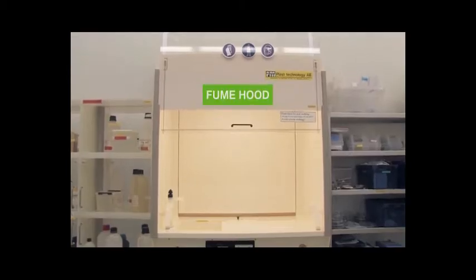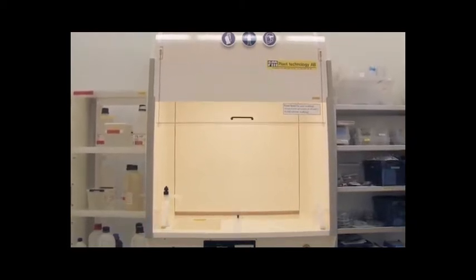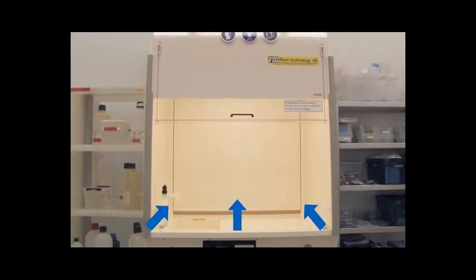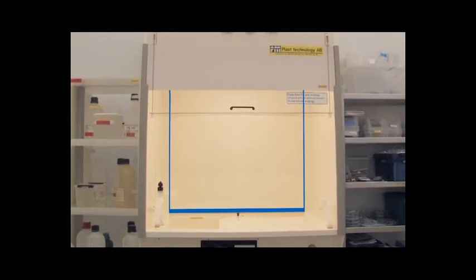A fume hood is a cabinet equipped with an exhaust and usually has a sliding window at the front. Air flow is directed from the clean room into the fume hood. Air exhaust vents are located at the rear of the hood.